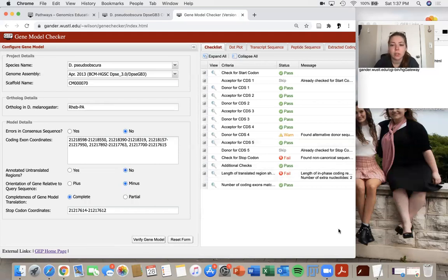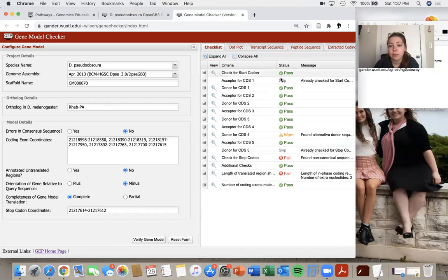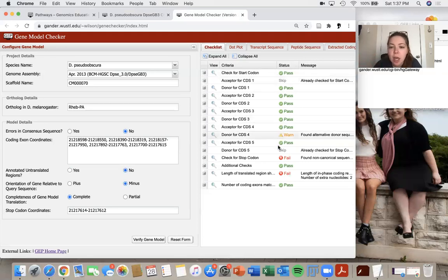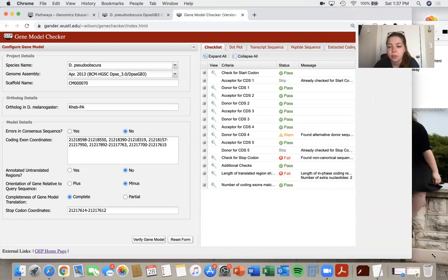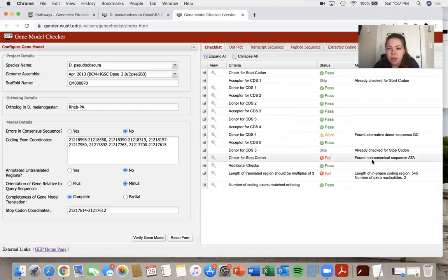So it looks like I have some issues here and I will go through them looking from top to bottom. So all these ones that have a green check and pass, we're good. We don't really need to do anything with that. If we see a fail, let's read what it says. So the first fail says found non-canonical sequence ATA.